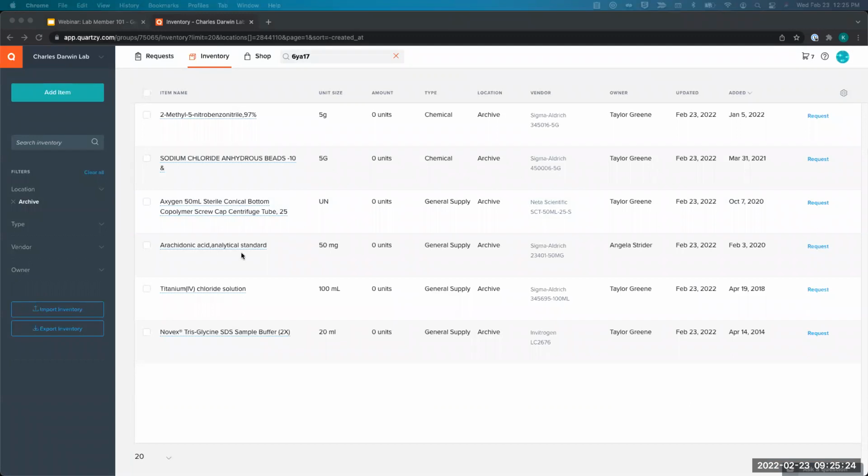And Monica, if any questions have come in, we can go ahead and answer those. Yeah, so we did just get one related to marking items as received and what we get in the email notification. So the question is, you mentioned what info goes on the received emails, but I do not see the location anywhere. We have to go to the inventory to see where it went. Is that normal, or do we need to change a setting? So it sounds like they're not seeing location in those email notifications. Do you know why that could be?